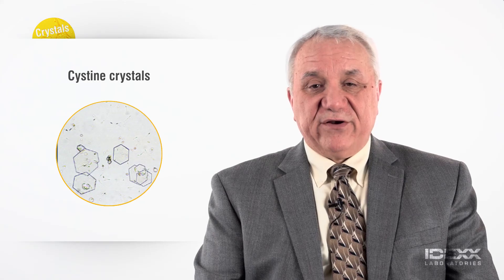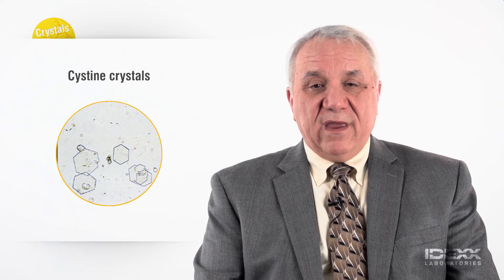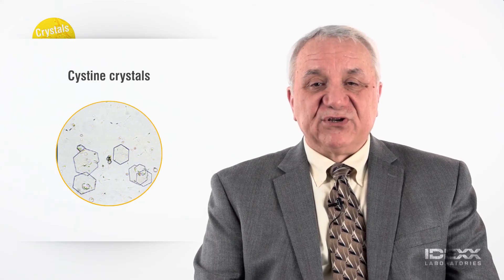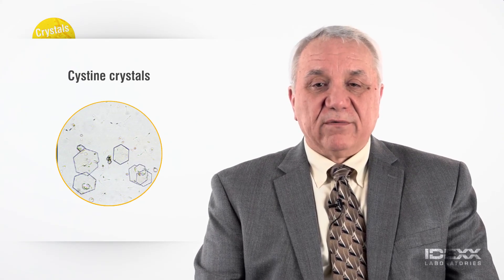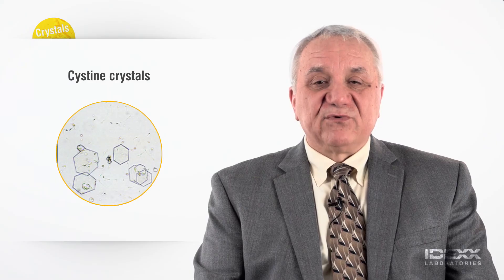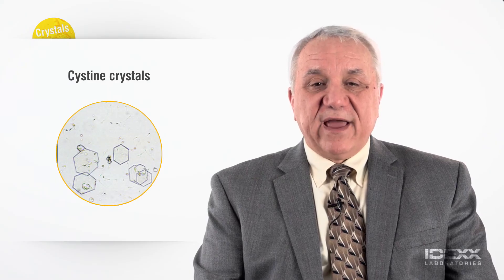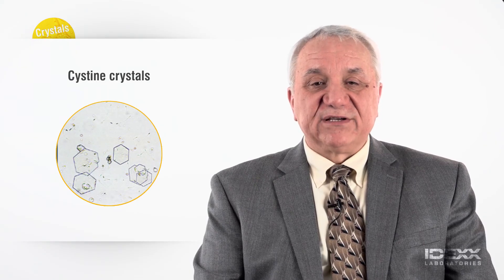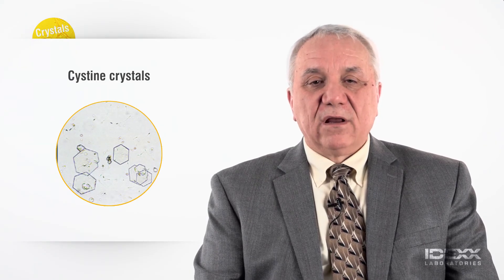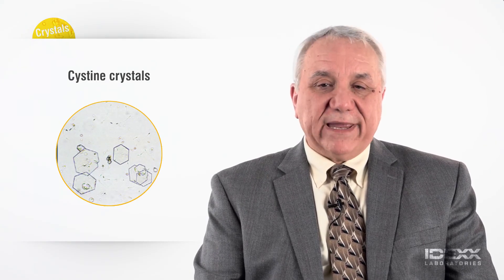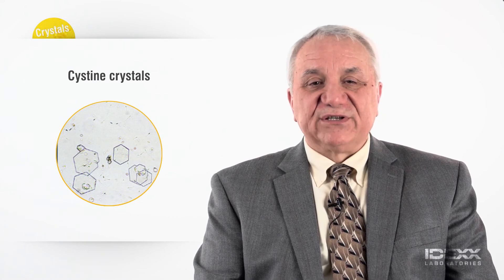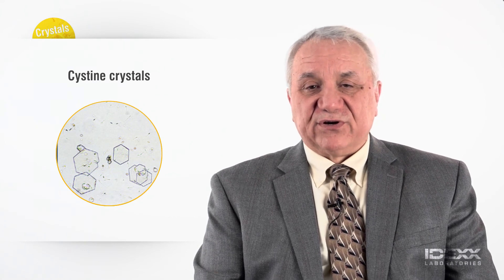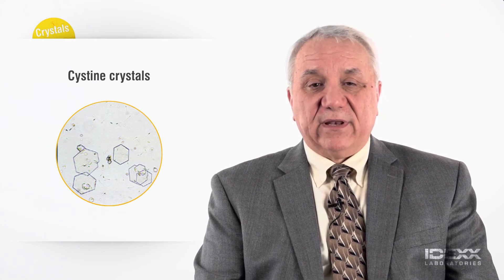Cystine crystalluria is never considered normal, and when present suggests an underlying metabolic disorder. These crystals are typically identified as six-sided or hexagonal, colorless, plate-like crystals. The various sides of the crystals are typically equal in length.